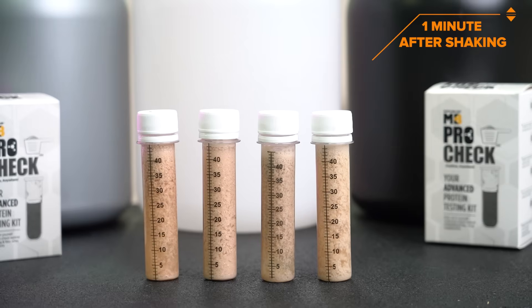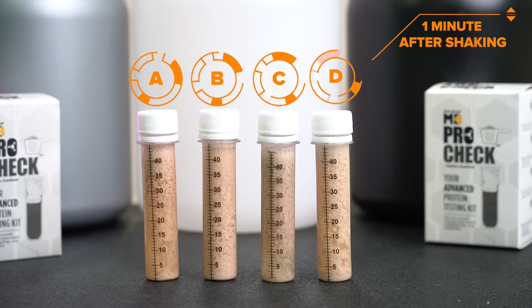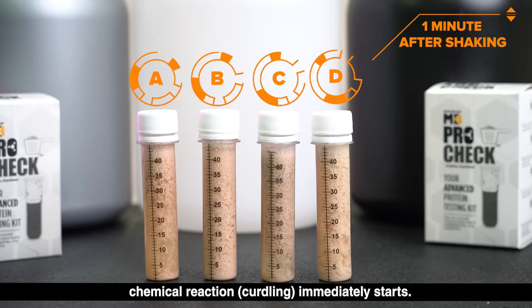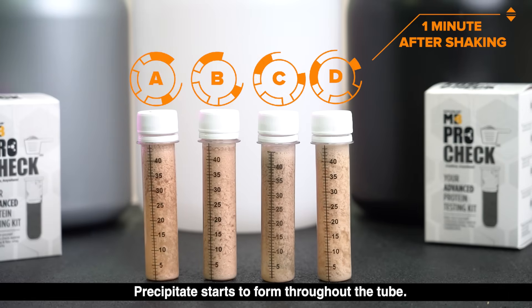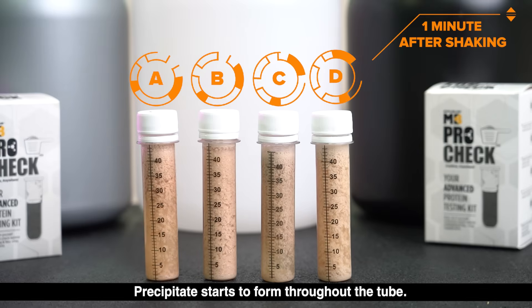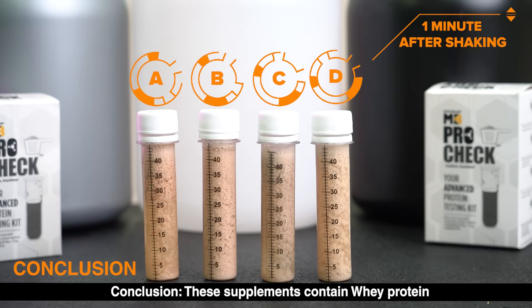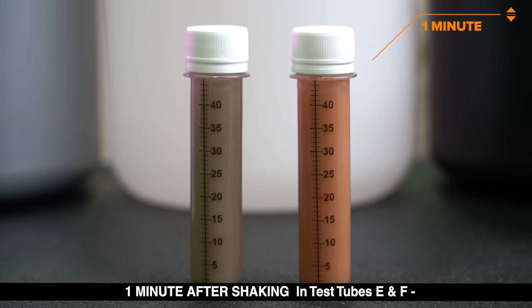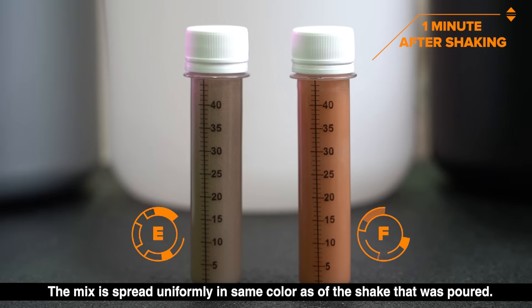One minute after shaking, in test tubes A, B, C, and D, a chemical reaction — curdling — immediately starts. Precipitate starts to form throughout the tube. Conclusion: these supplements contain whey protein.